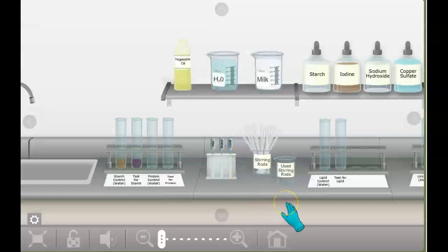Okay, so now for the rest of my tutorial in PreLab. Look at these 2 colors. Yeah, you can even pick it up if you want and hold it against the wall. This looks like a brownish, but look at the iodine. That's what you want to compare it to.